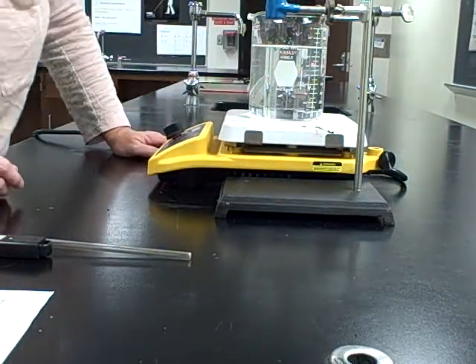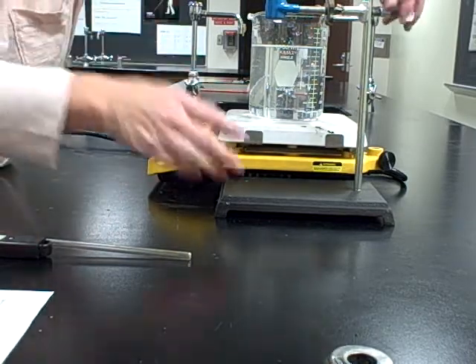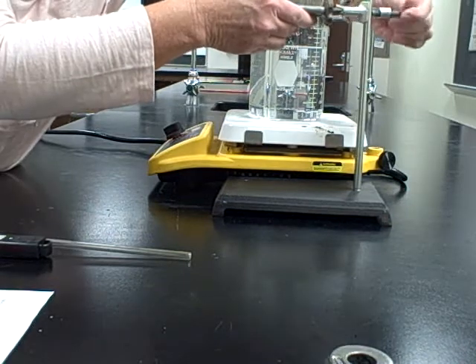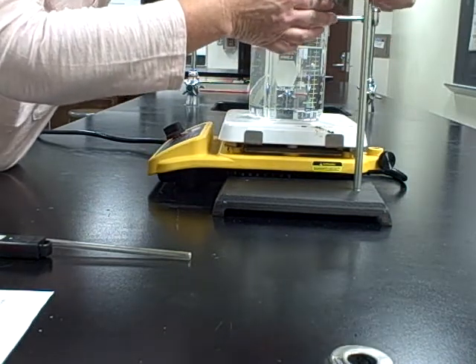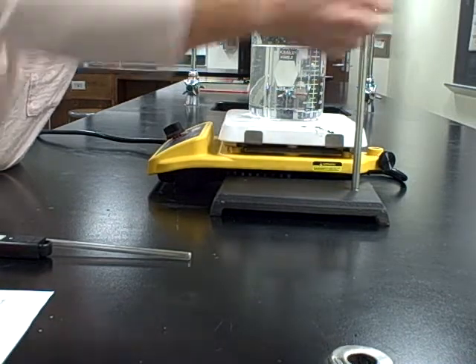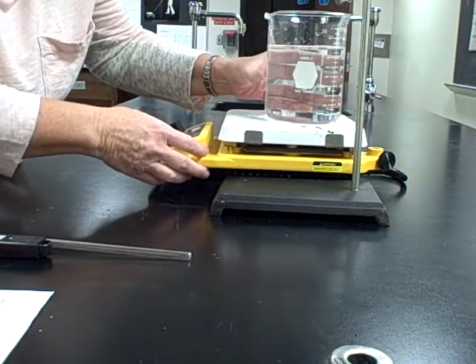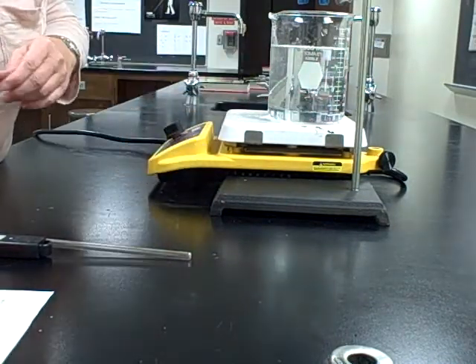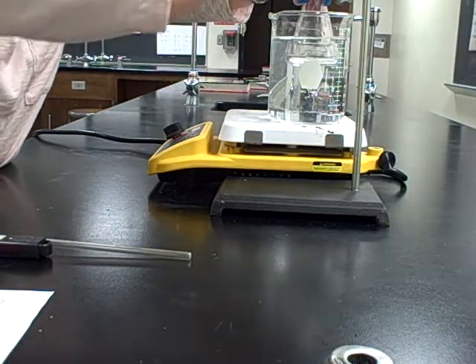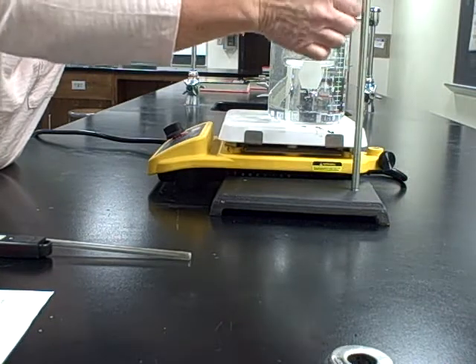I'm going to want my beaker on my hot plate to be heating it up. So I've got my ring stand right next to it. If I loosen here, I can turn this around so I can clasp my flask and I'm going to have to slide this over to the edge. Right now I don't have anything in my flask. I'm just looking to see that I can attach it here.